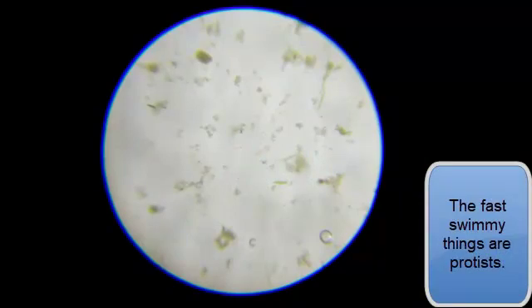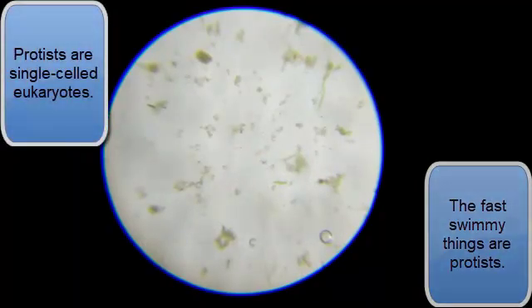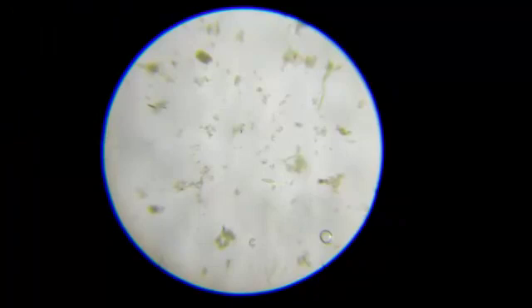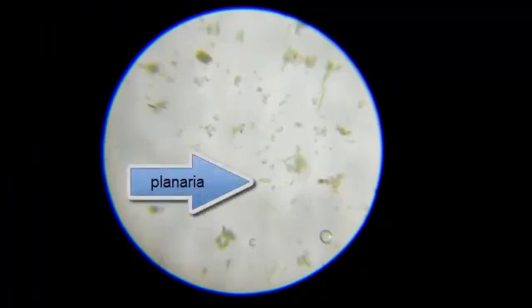So the other things that you're seeing, these green bits, are different types of algae. And I do believe, am I right, Mrs. Beaver? Is that a planarian crawling around right there?